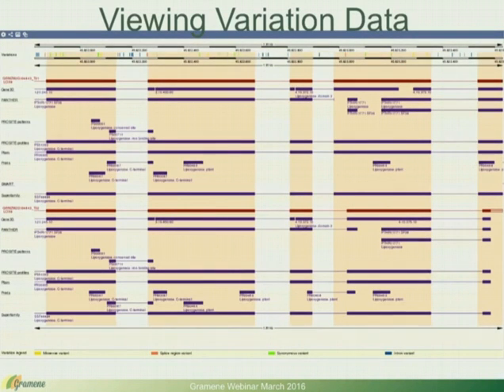So here I only want to give you a flavor of the type of images and text downloads that you can get for variation. In this particular slide, you are seeing a gene that has 2 transcripts in red, and the variations, individual SNPs, are shown as ticks up here in the first track, color-coded, and you have a legend that tells you what kind of predicted functional effect this variant could have, interspersed with protein InterPro domains.